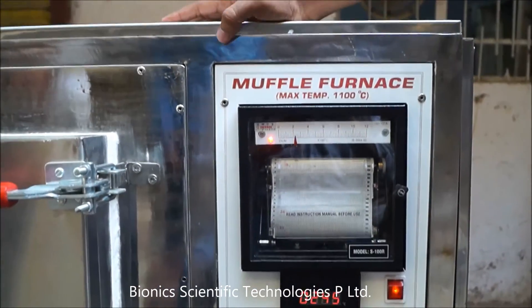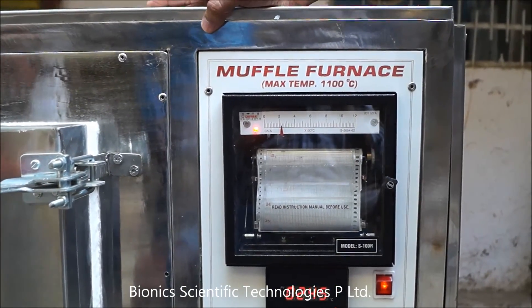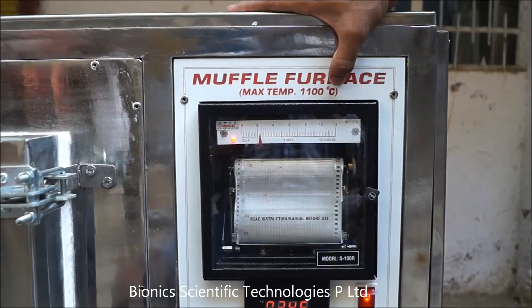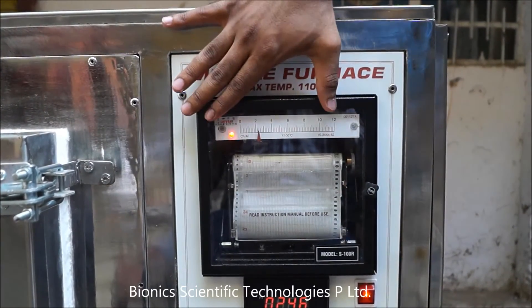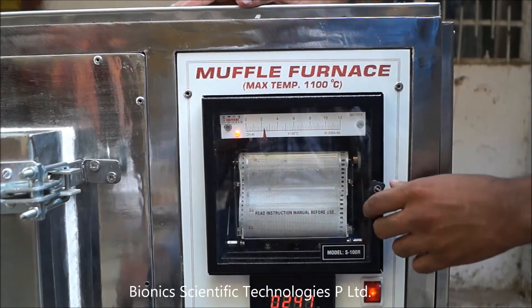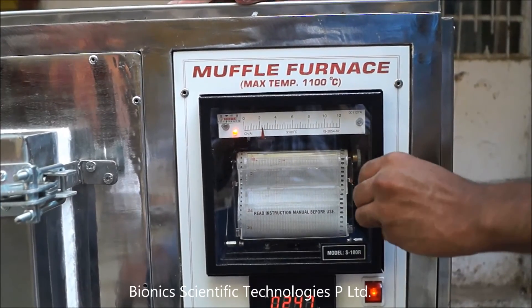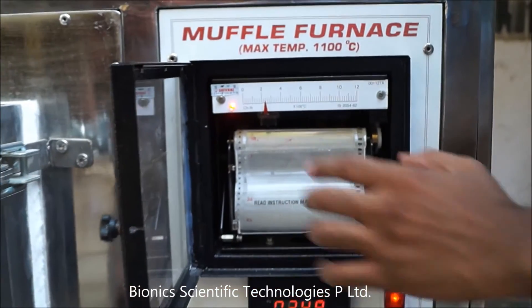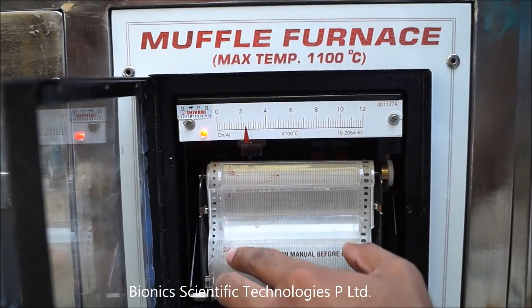This Muffle Furnace can produce up to 1100 degrees Celsius, as mentioned here. This is the temperature chart recorder, which keeps a record of your temperature. You can open it like this, and it prints the temperature for your records.